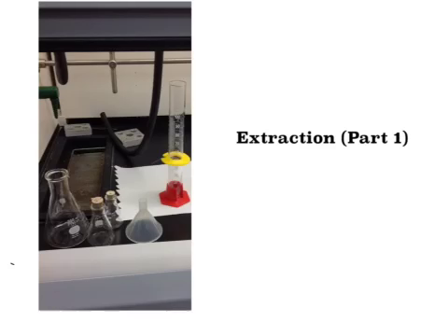In this experiment, we explained how extraction was conducted by answering the following questions. What is liquid-liquid extraction? Is benzoic acid soluble in both water and methylene chloride? And why is it more soluble in one than the other? We also contrasted single extraction and multiple extraction methods and which was more efficient. We also explained what KD was and its usefulness and how we were able to calculate it. And we also determined the amount of benzoic acid extracted.